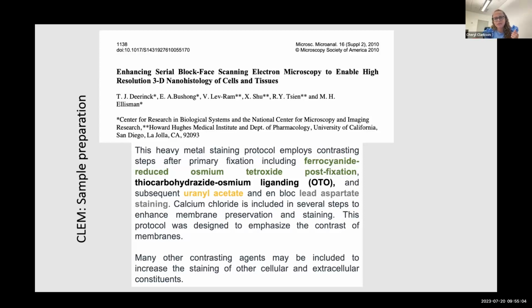You can decrease the potassium ferrocyanide, you can decrease the TCH a little bit, and play with it until you find the perfect condition, troubleshooting on other tissue. Don't use your CLEM tissue that you already imaged with light microscopy for testing; test before. But it's a very good start. We have been using it for kidney, for bones, and for CNS, which is the easiest: spinal cord, brain. It's a very useful technique that is very easy to approach.